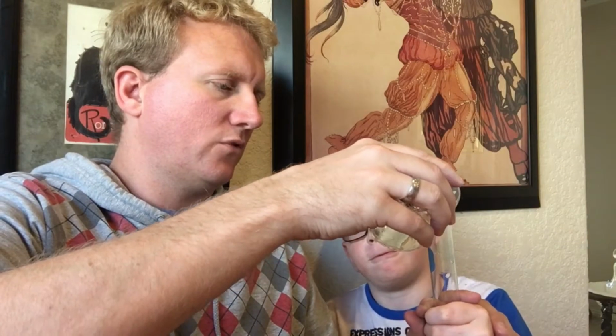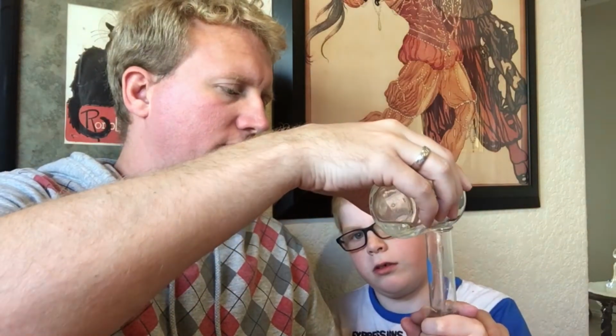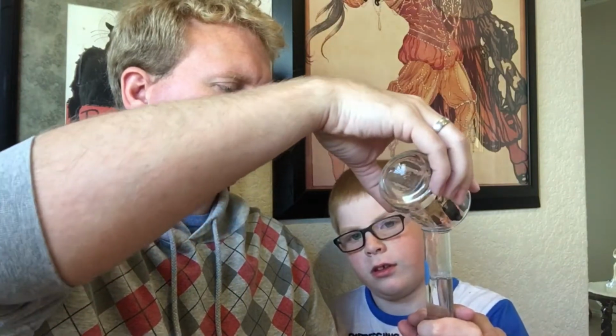All right, so we got our chalk in our balloon, and now what we're going to do is pour the vinegar into the test tube. Can you hold the test tube, please, Lab Assistant Finney? And pour in the vinegar. Very carefully. Otherwise, we'll smell like salad dressing all day.